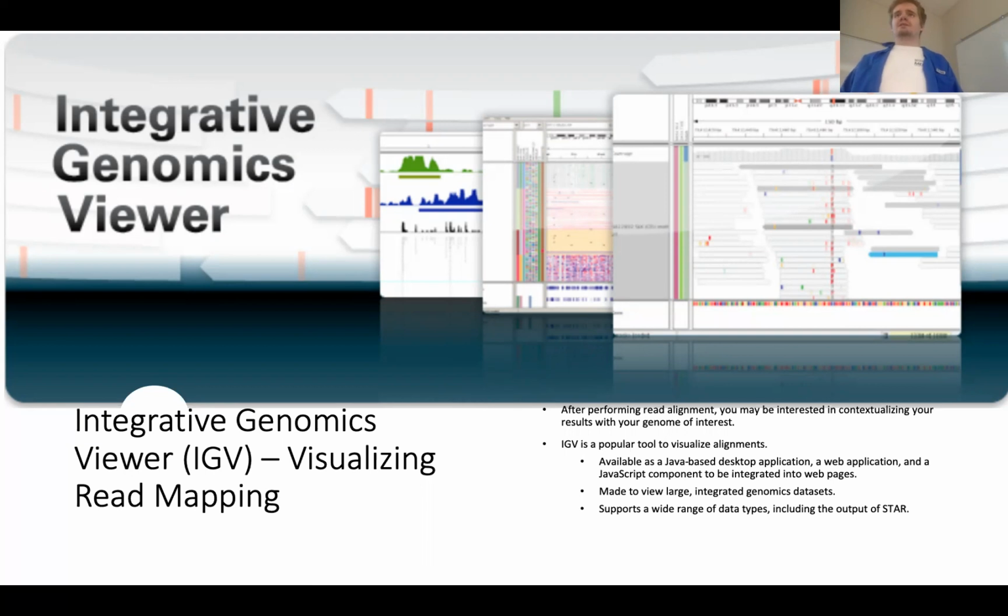That's the same deal with IGV. We can upload our own genomes onto IGV and run it with whatever genomes we have that aren't necessarily available through IGV's website. It can view large integrated genomic data sets, and it also supports a wide range of data types. Most importantly, for our purposes, it includes BAM format.